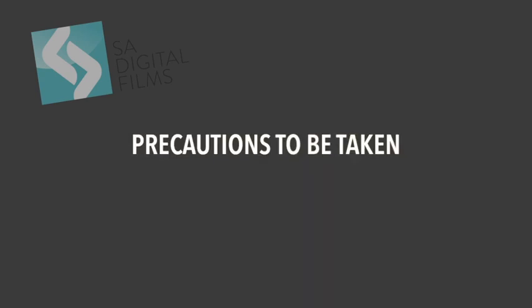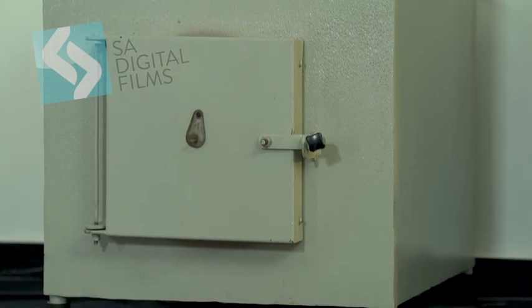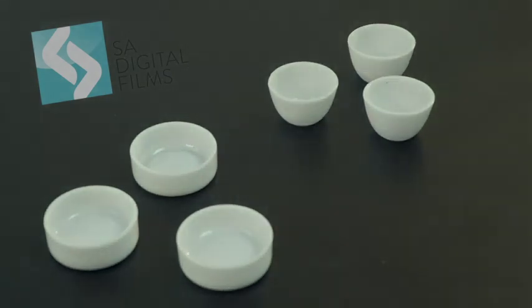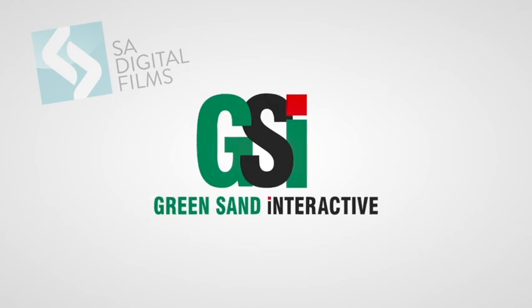Some of the precautions needed to be taken are: ensure proper calibration of the muffle furnace, ensure that the thermocouple of the muffle furnace is air suspended and not touching the muffle, avoid spillage of the material, and use clean silica crucibles. So this is how you determine loss on ignition of the given sand sample.